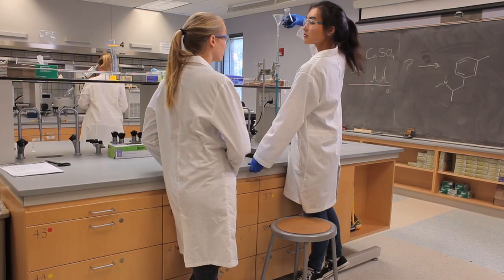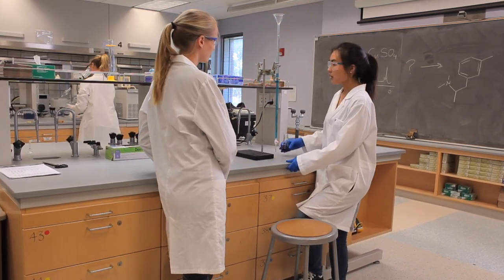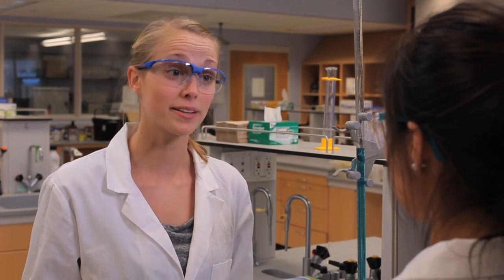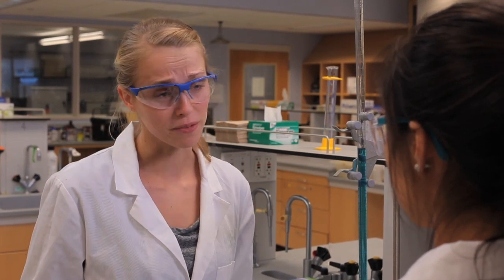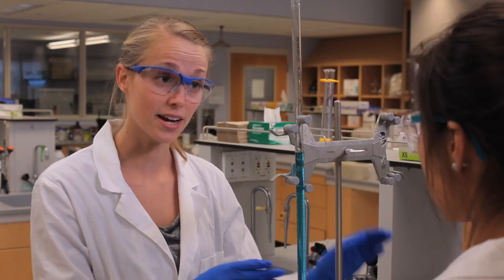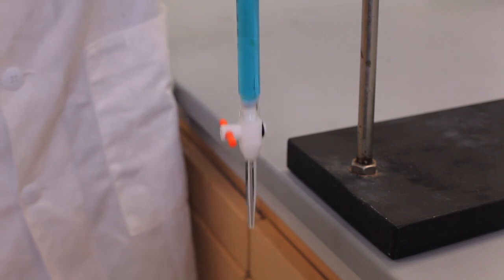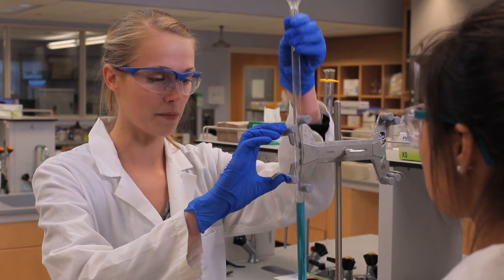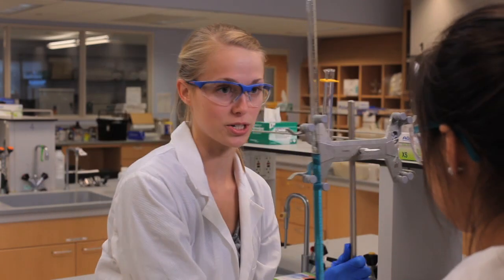Kate, this isn't very safe — will you please step down? I know I'm not supposed to fill anything up by reaching above my eye level. That's true, you definitely don't want to risk spilling a solution from above, but at the same time you may fall from this chair. A better way of doing it would be to move the burette to the side of the bench and move it down so that you could do your work at eye level. Then when you're done, you can move it back up and push it back. Okay, that makes sense. Thanks, Kayla.